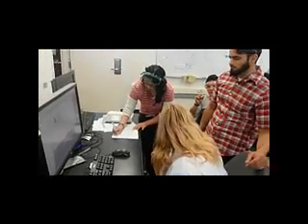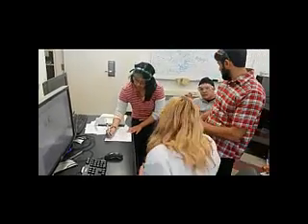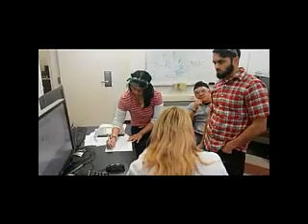So once you look at the elution time from the HPLC, it's a different eluting time in the MS? Slightly different, just a little. What's going on is you have a sample, it's injected, it goes through a column which separates everything based on its polarity, and then it's read by the UV detector.